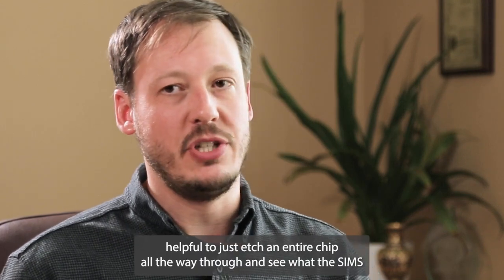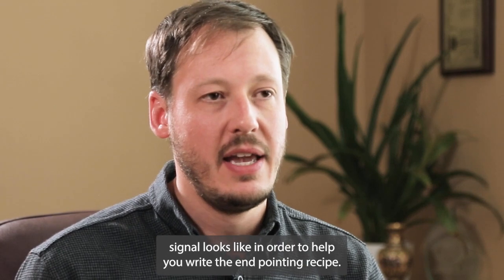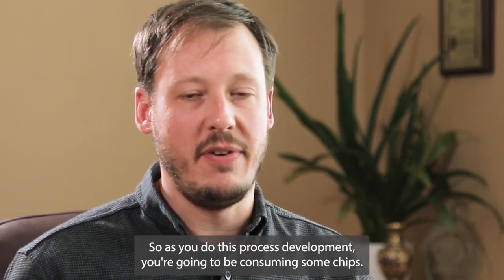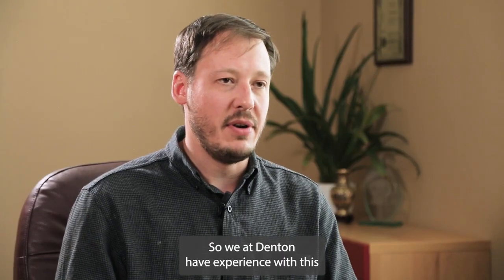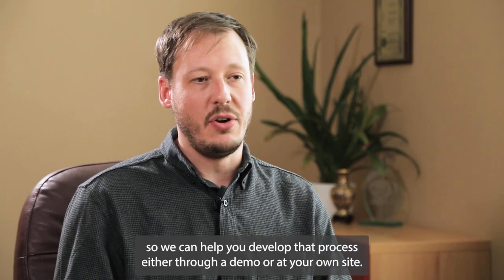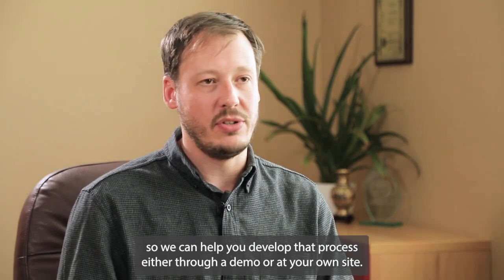And in addition, it's often helpful to just etch an entire chip all the way through and see what the SIMS signal looks like in order to help you write the endpointing recipe. So as you do this process development, you're going to be consuming some chips. So we at Denton have experience with this, and we have our dedicated tool in the apps lab, so we can help you develop that process either through a demo or at your own site.